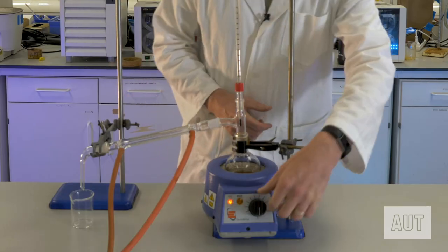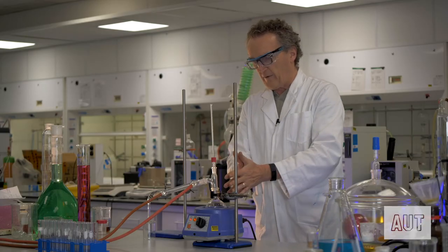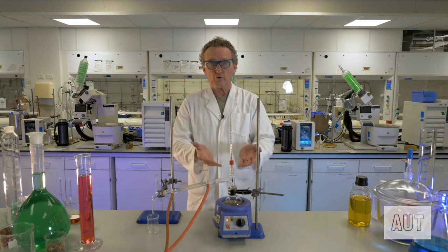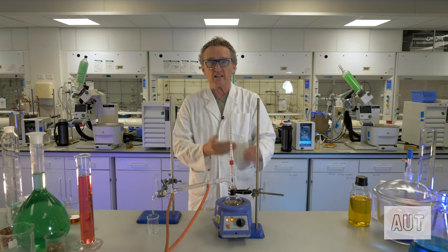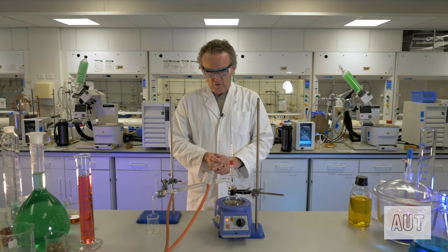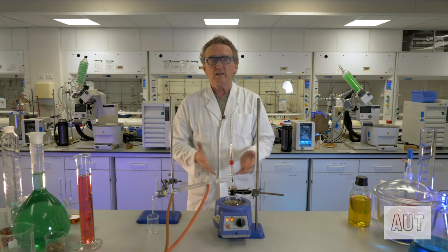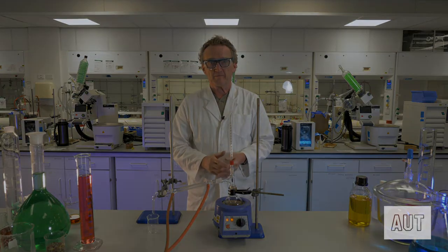So what we are now going to do is turn on the heat. We've got our anti-bumping granules in there, and the anti-bumping granules are, as the name suggests, to stop your solution from boiling too vigorously or bumping. It means it's just going to simmer away, a nice gentle boil rather than bump, bump, bump. So we're going to have to wait a while for this to get underway. It's got to heat up to boiling. So we will take a little break and we will see you in a few minutes.